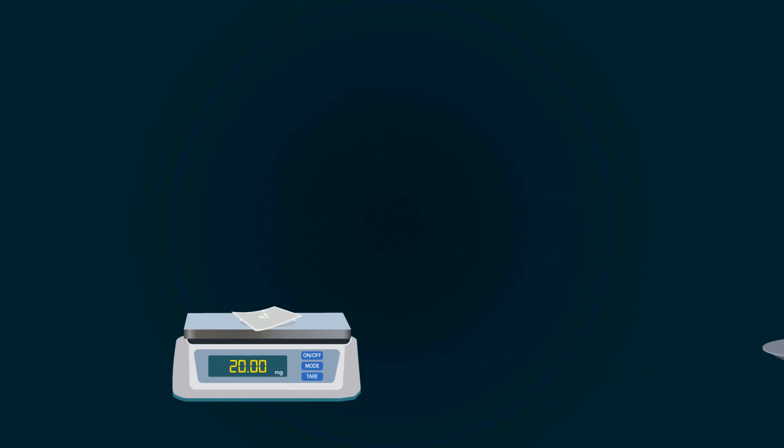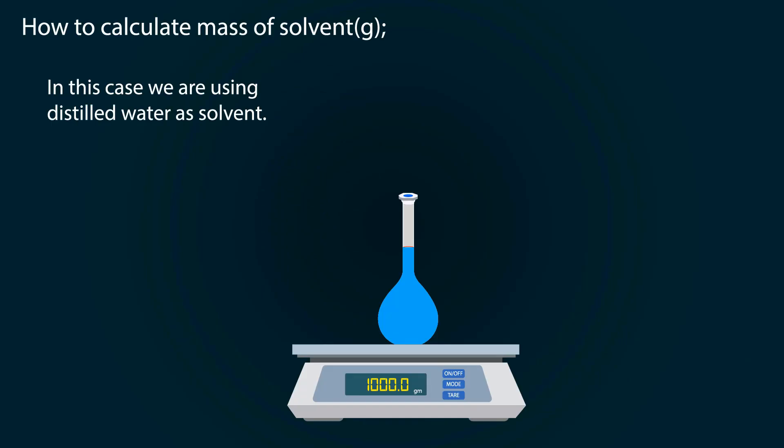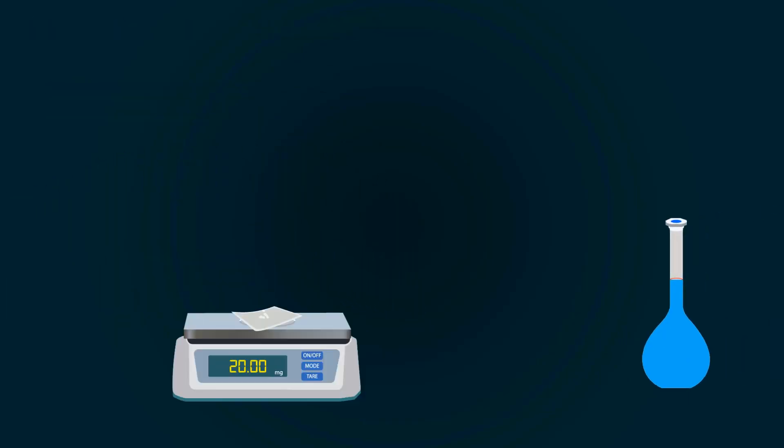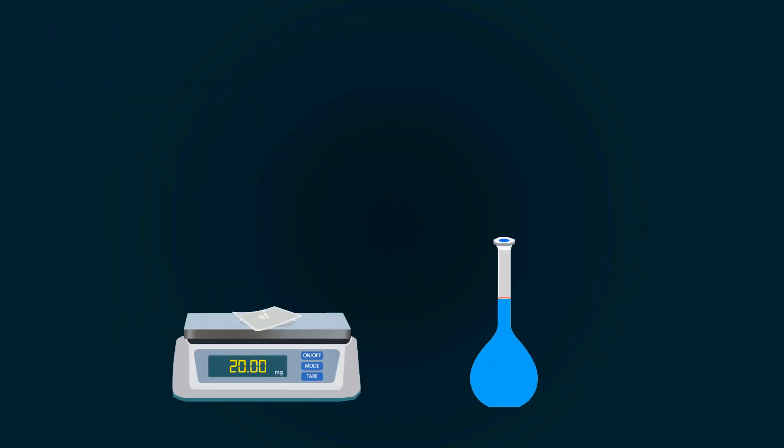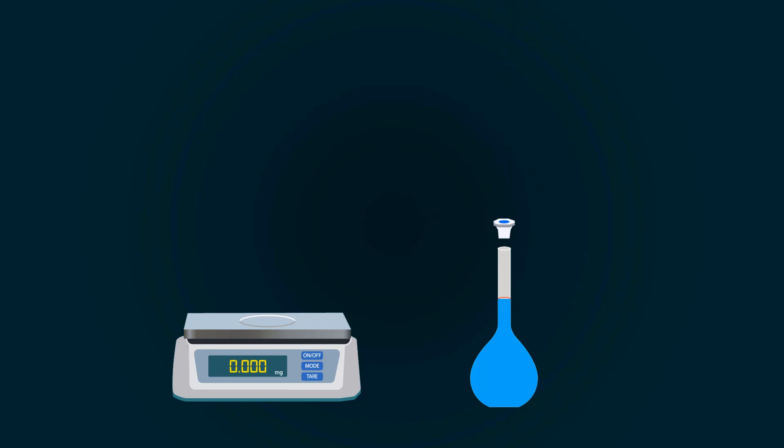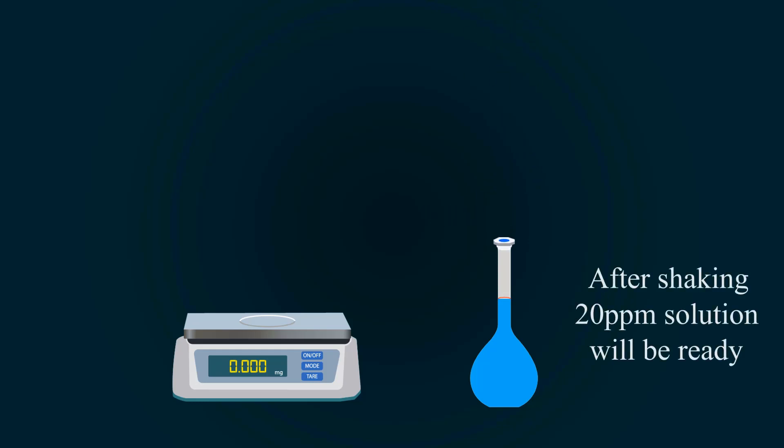Now add this 20 milligrams into the distilled water in the volumetric flask. Please add the solute with the help of a funnel. After adding the solute, close the volumetric flask and shake it well.